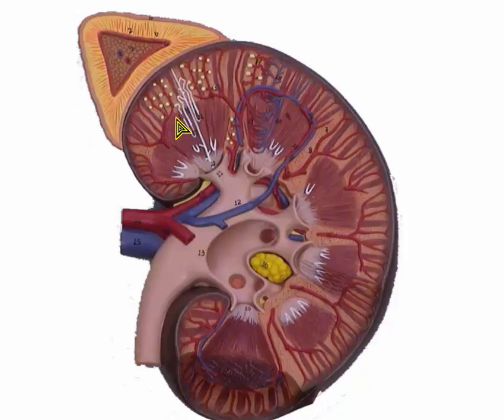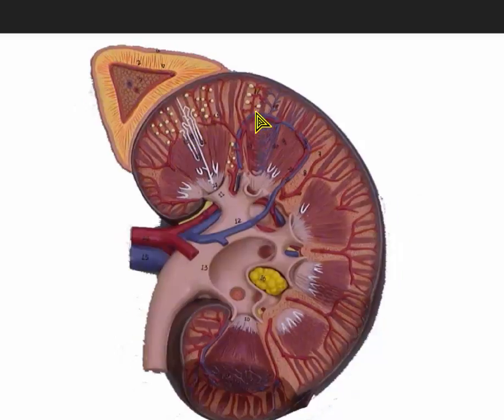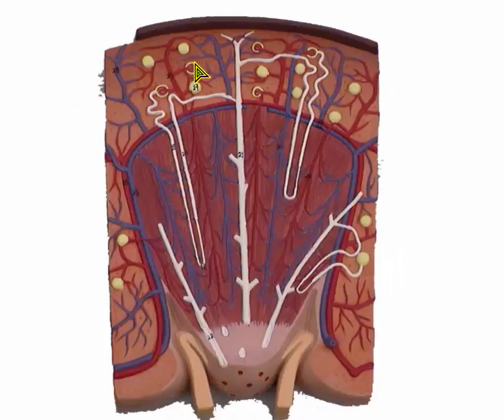You should know basically what a nephron is. Here's the cortex again because here's renal corpuscle, renal corpuscle, renal corpuscle, and we find those in the cortex.